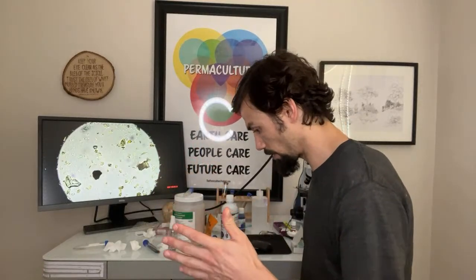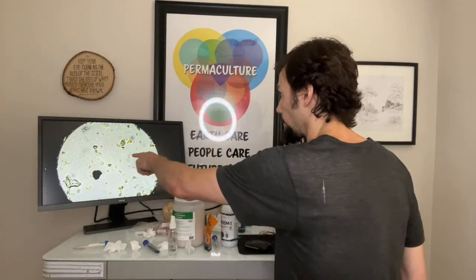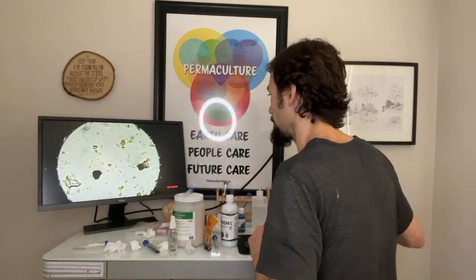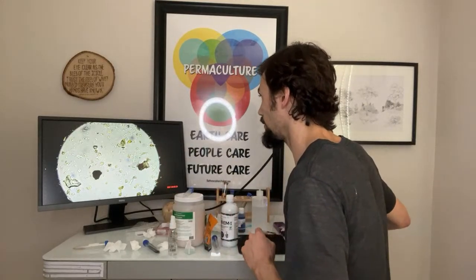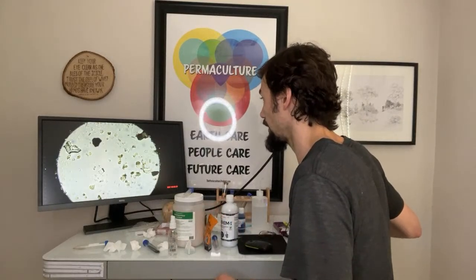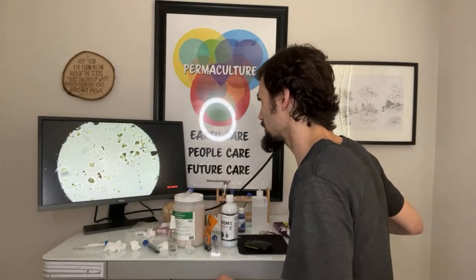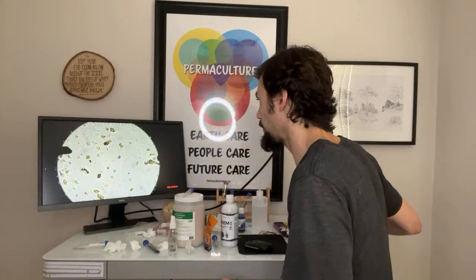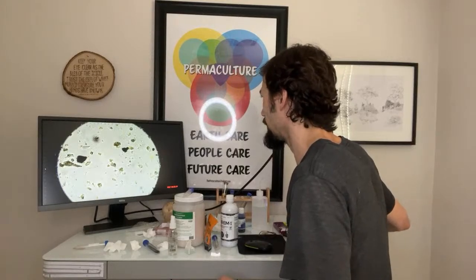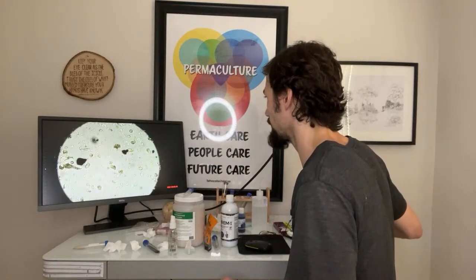Our first one that we looked at in Recharge, except that's much larger than the one where I was like, this spore's not like the other spores. That's the same exact spore. So we're seeing overlap between them, and that's true because the labels actually have a lot of overlap. So yeah, I'm seeing spores, not as many spores as Recharge. Wow, a greater diversity of spores. Let me just take a picture of this.